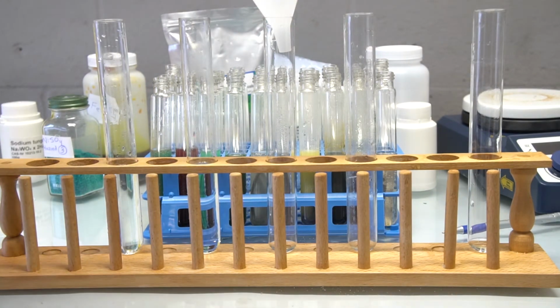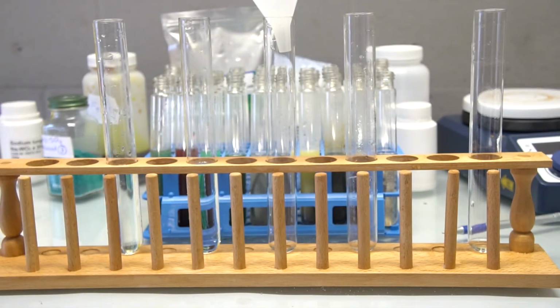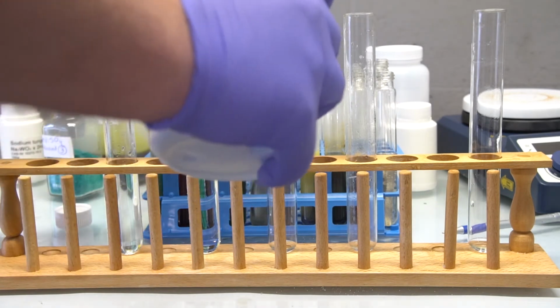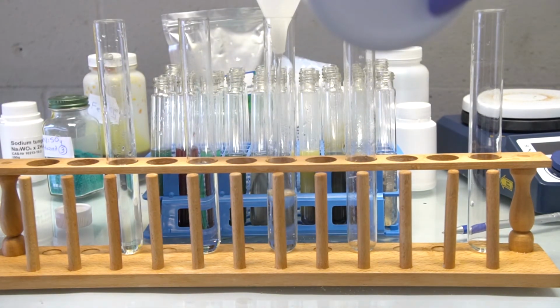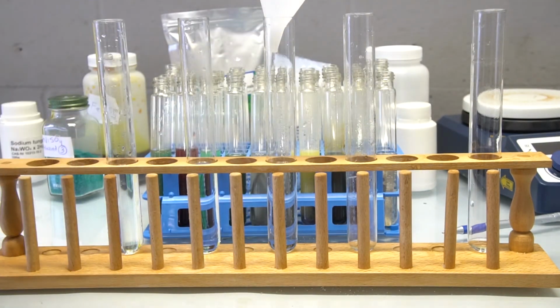So which acids did we test? We tested adding magnesium ribbon to vinegar, which is 5% acetic acid, 31% hydrochloric acid, 93% sulfuric acid, dilute nitric acid, and 68% azeotropic nitric acid. One of these reactions was quite spectacular, as you will soon find out.